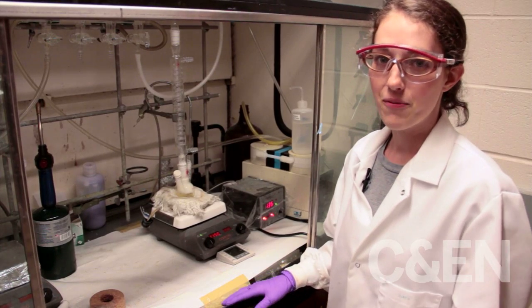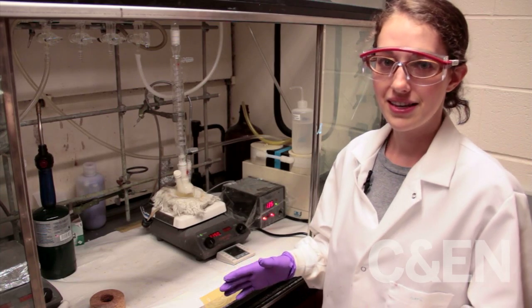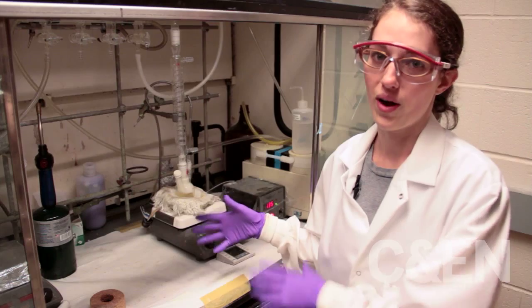In our group, we make and use quantum dots, which are cadmium selenide nanoparticles. Today I'm going to start out by showing you how we make them.